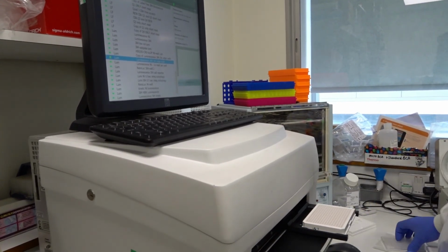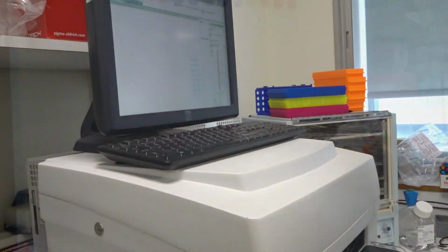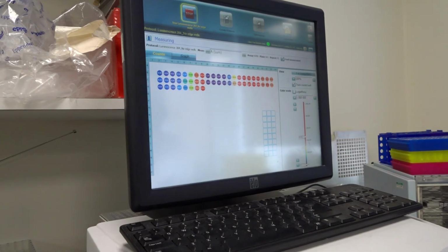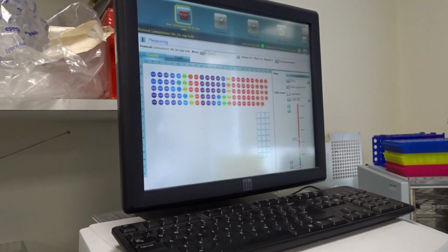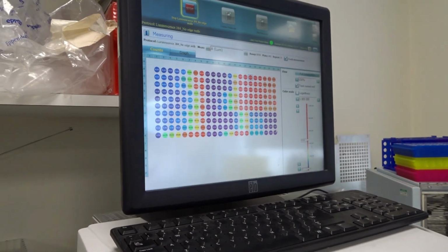To validate your results, screen compounds with known activities, ideally with a range of potencies, along with controlled samples on the same day and different days. This will increase the confidence you have in your assay to detect active compounds in a consistent manner.